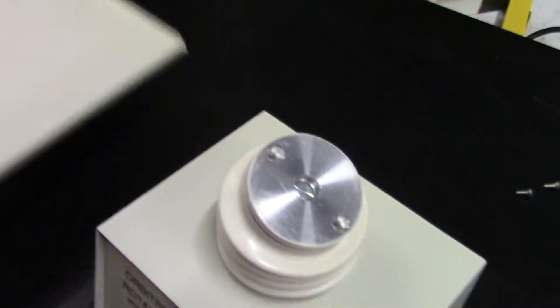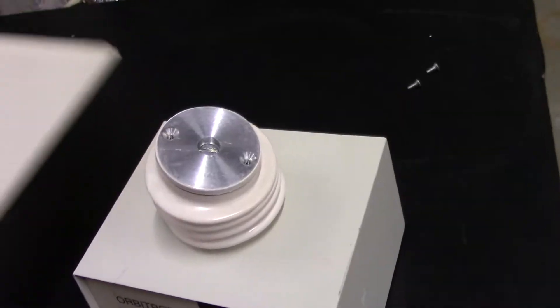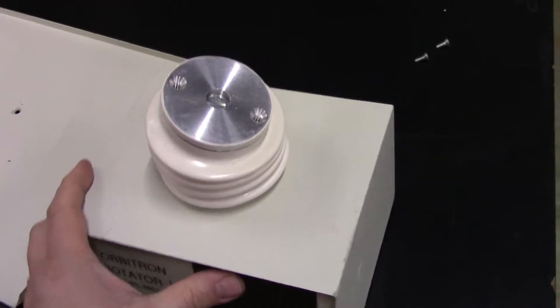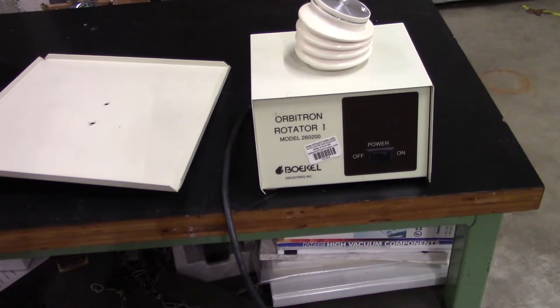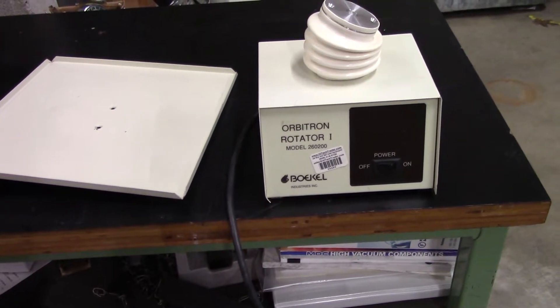What you're going to do is take the two screws supplied, overlap it, and screw your head in. Thank you very much from HitechTrader.com. This is the Bokel Orbitron Rotator 1.